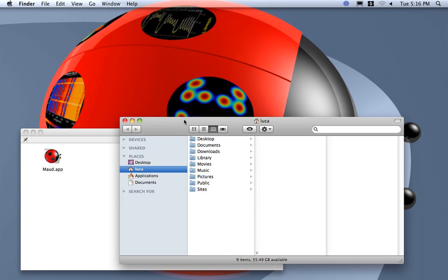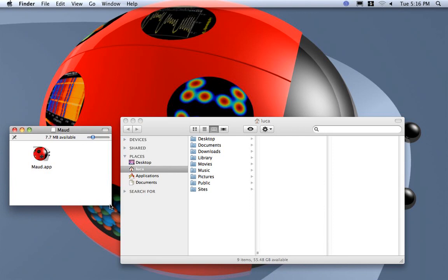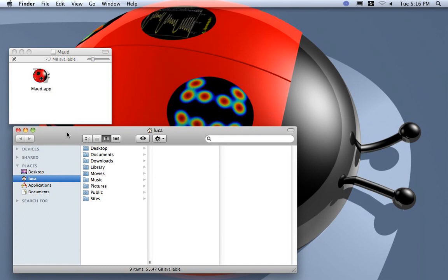On Windows you probably get a zip file so you just unzip and extract the folder containing the application and all the libraries you need.